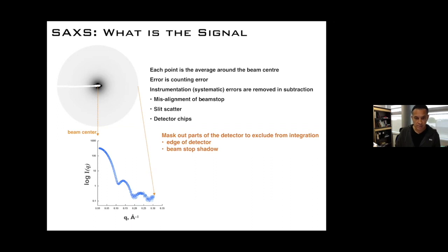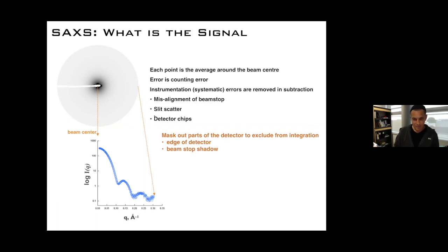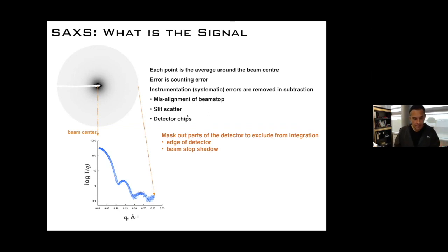Sometimes there might be a vibration or something moves slightly, and you'll see flaring around the beam stop especially with misalignment. What you see in white is the actual beam stop — this was at ESRF from a long time ago. What beamline scientists will do is mask all this out so that when they do the average they skip this part. You should ask your beamline scientists to redo the mask if you see a problem.